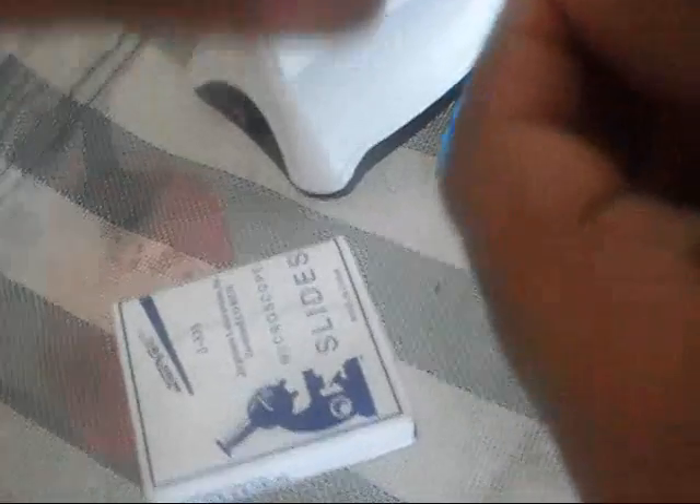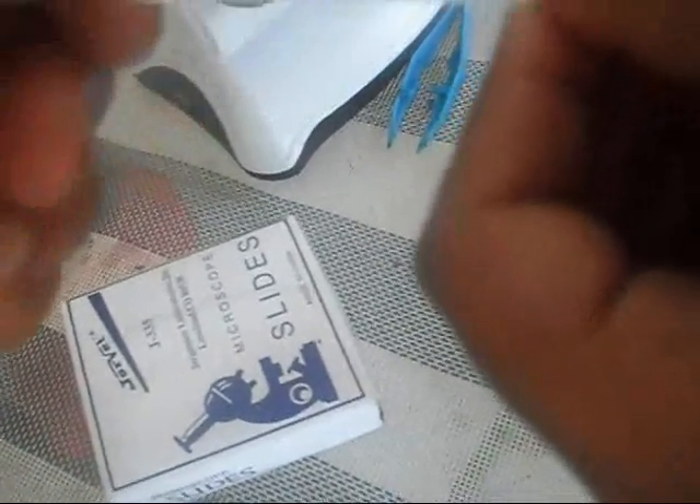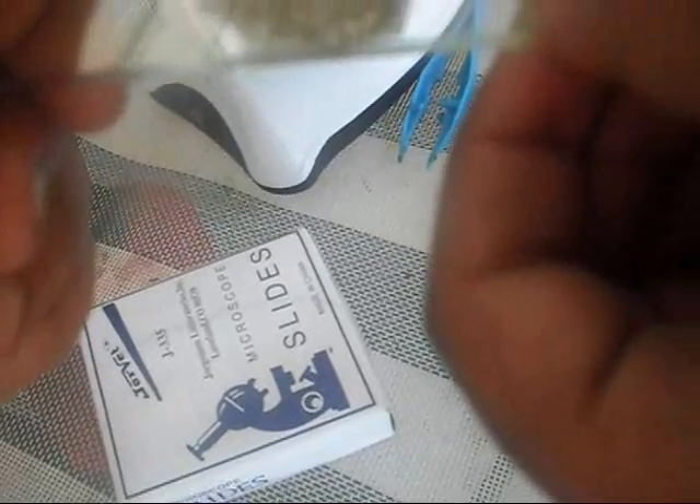All I need is just two microscope slides. Then I lay the thing down and get another microscope slide. You can use covers but we only have slides right now. And we need tape to tape them together. I'm going to go get tape.